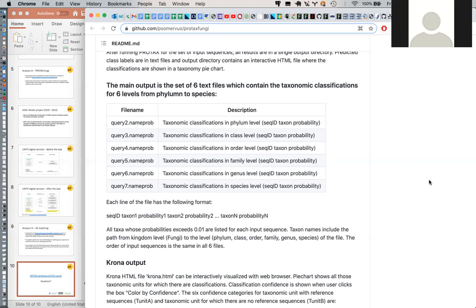Okay. Yes, sorry. But this is probably a very, very simple matching anyway. So it should be, I suppose, very, very fast. No, it's not actually, because it uses the same methodology, and this includes the BLAST part of all the sequences in some cluster. So yeah, it's quite resource demanding at the moment.